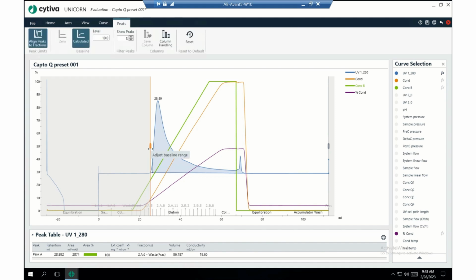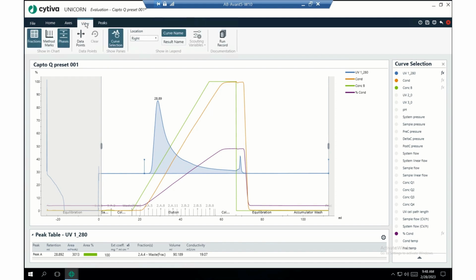So right here, we're at, what are we at? This isn't a real marker. So can we get the real marker up here? Few data points. Okay, here we go. This is what I'm looking for. Okay, so right here, we're at 22% or 7.38 millisiemens. We go up to 47.